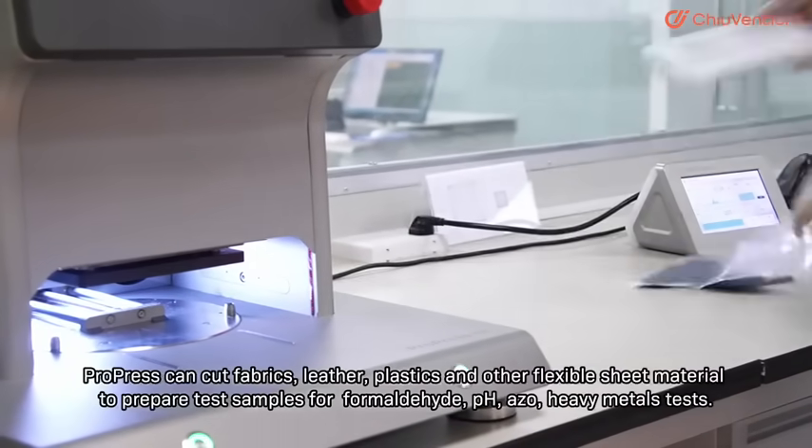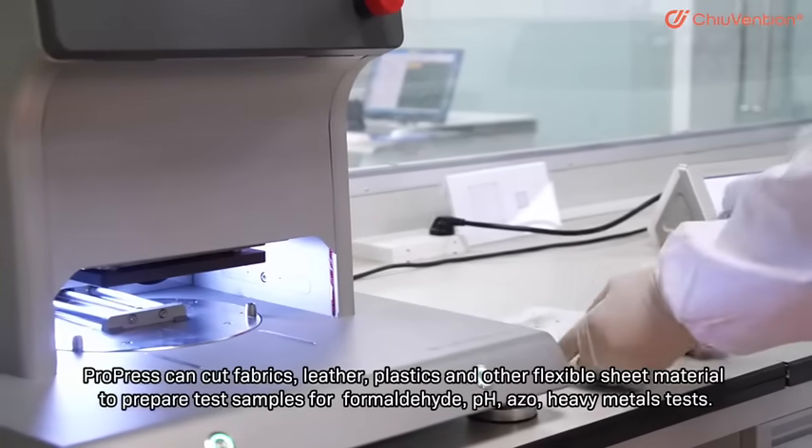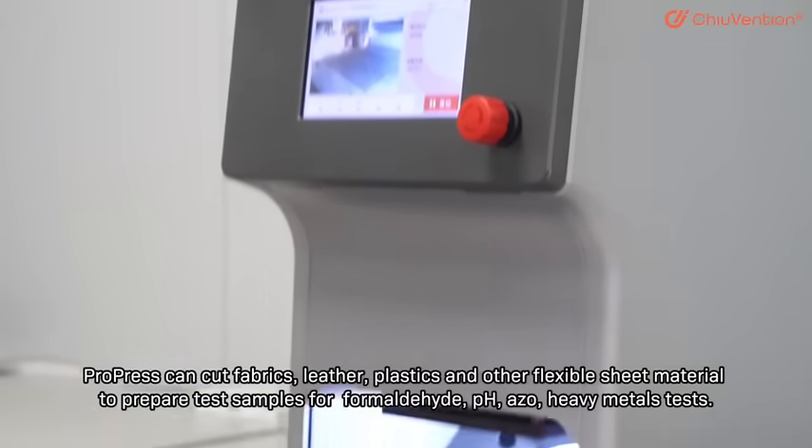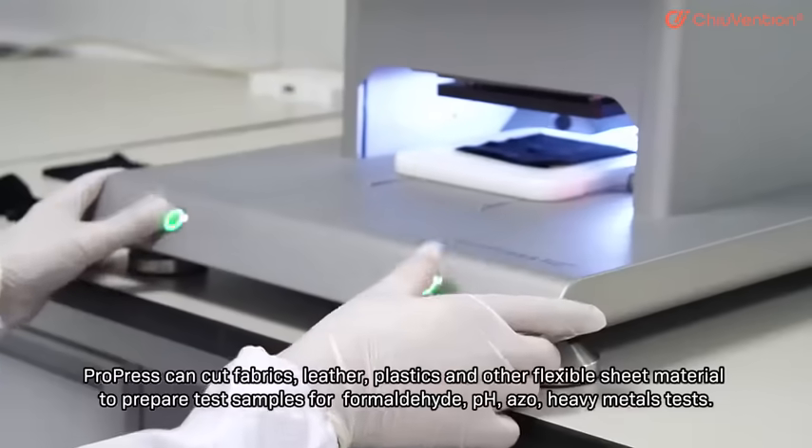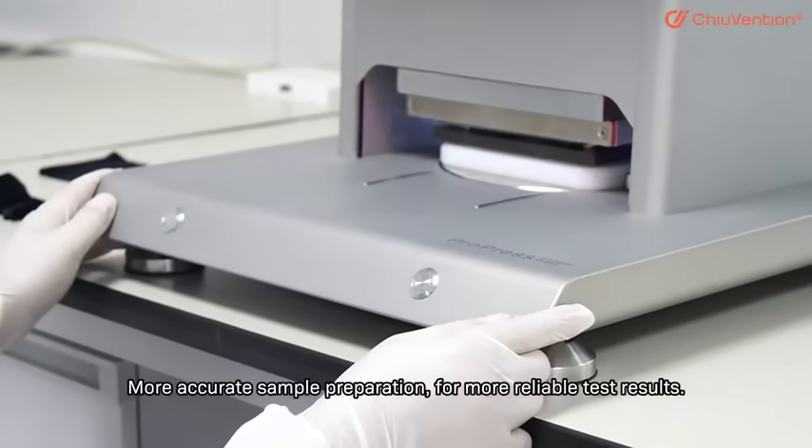ProPress can cut fabrics, leather, plastics, and other flexible sheet materials to prepare test samples for formaldehyde, pH, azo, heavy metal tests, enabling more accurate sample preparation.